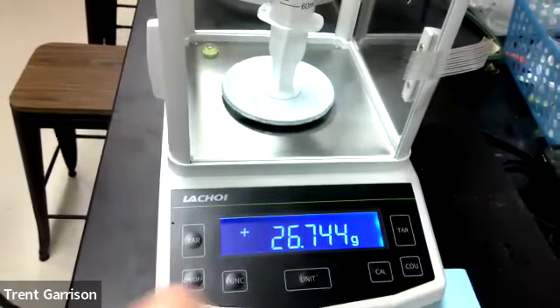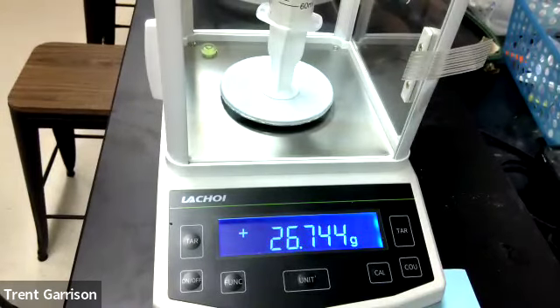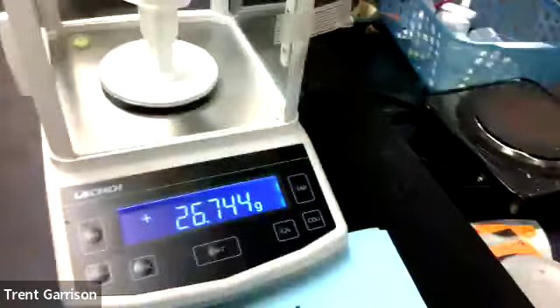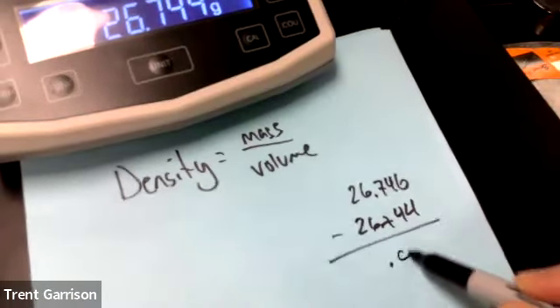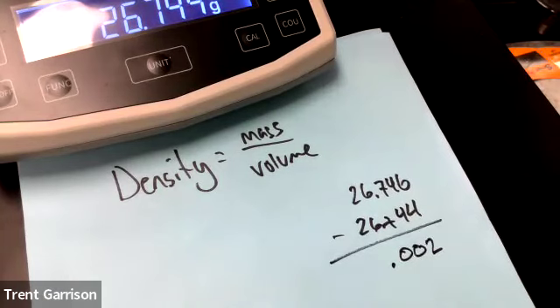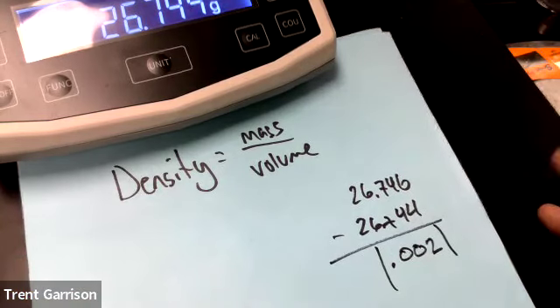All right. Now, here's where it gets frustrating: the gas is somewhat lighter, and so it went down in weight. It should have gone up, but the syringe is probably elevating it just a little bit, and it's causing it to have a little bit of buoyancy. And so the weight tends to go down, whatever the difference of the values is. In mine here, I've got a difference of 0.002. If it's positive or negative, just make it absolute value.